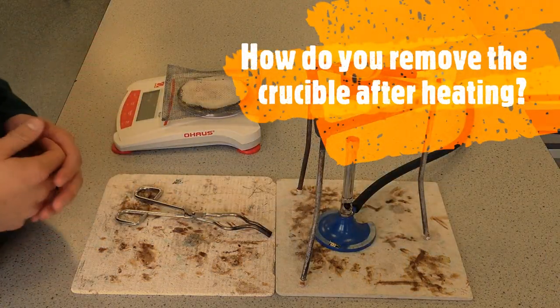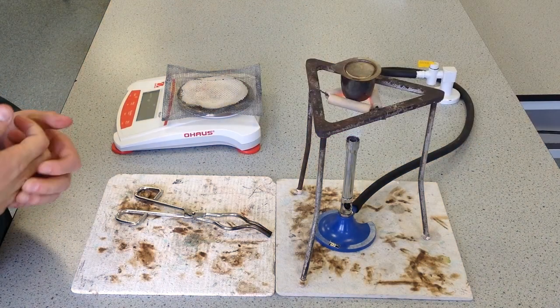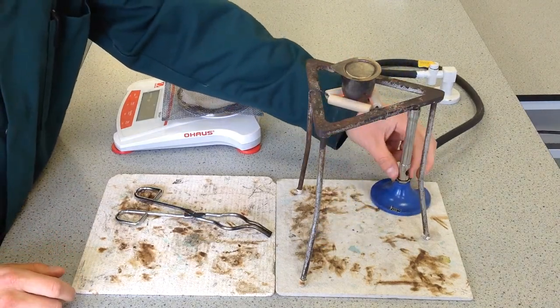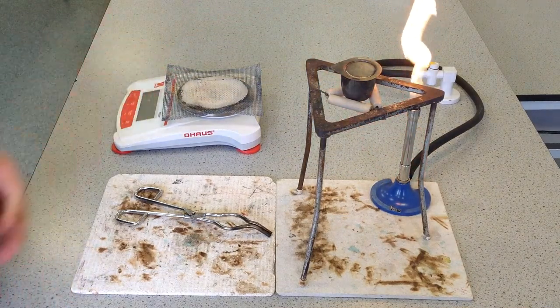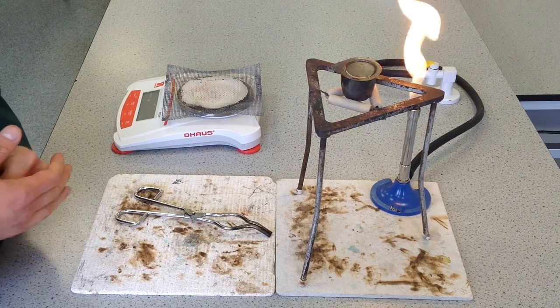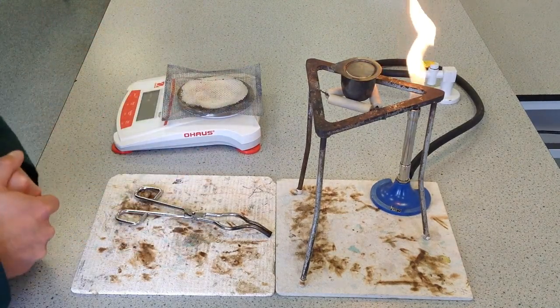Let's imagine you've been heating for some time and now you want to cool the crucible. The first thing to do is remove the heat source — take the Bunsen burner away and put it back onto the safety flame. Then leave it for about a minute to cool down in the pipe-clay triangle. There's no need to remove it; the air circulating will actually help it cool a little bit quicker.